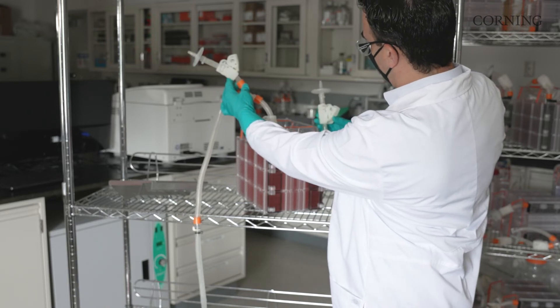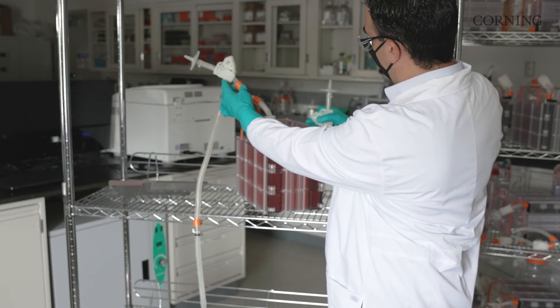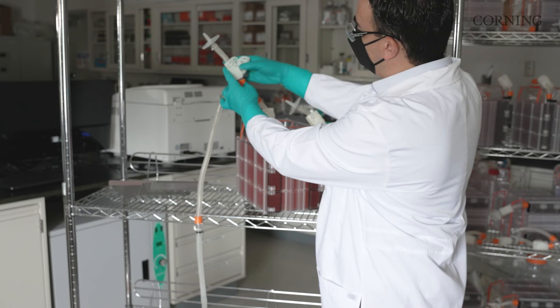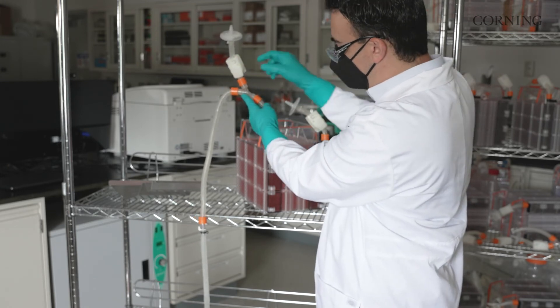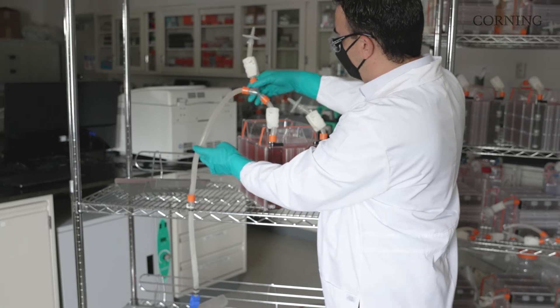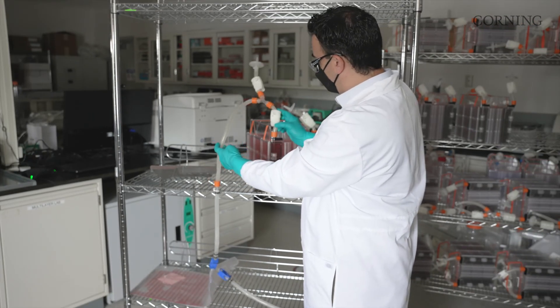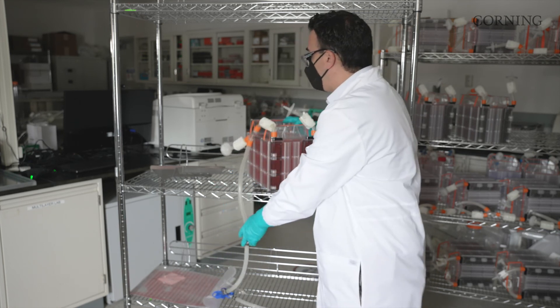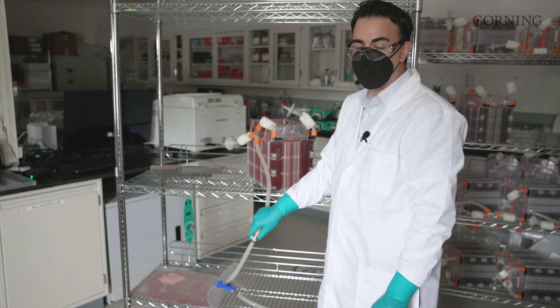So now all three of our clamps are open. We only need to do this for two or three seconds before we can fully close these clamps. This allows us to depressurize the vessel and make sure there's no residual pressure trapped in this HyperStack before it goes into the incubator. Now that we've chased the line and depressurized the HyperStack, go ahead and close our bag. Now we're ready to move into the biosafety cabinet to make a sterile disconnect of these NPCs.